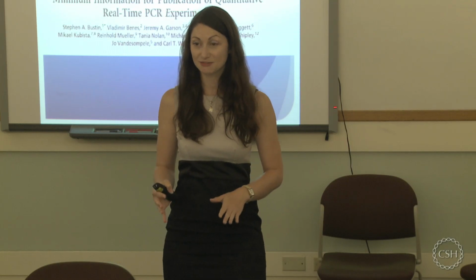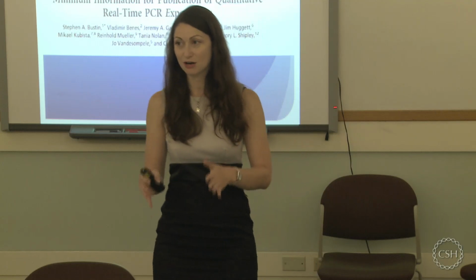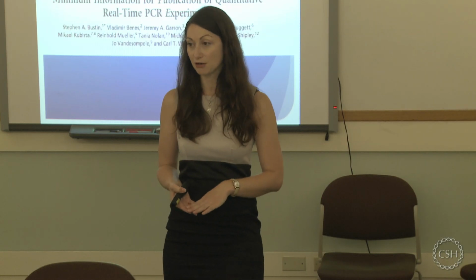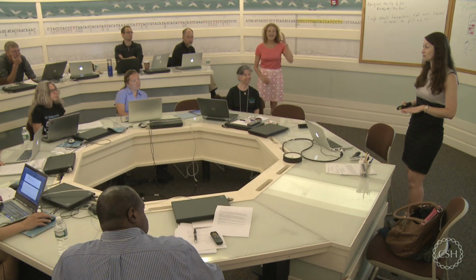And it's very extensive. I would not recommend adhering to all of these points because otherwise you can make an entire paper just out of your qPCR reaction. But it is certainly helpful if you have any questions. It has a lot of good background material. And that's the last thing I wanted to show you today. If you have any additional questions, please feel free to ask me.